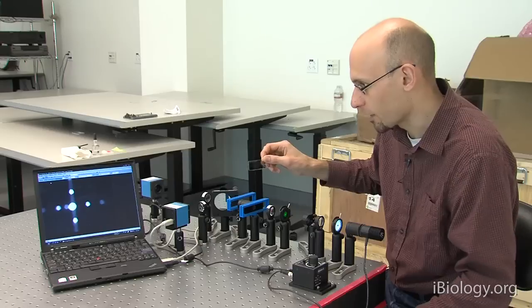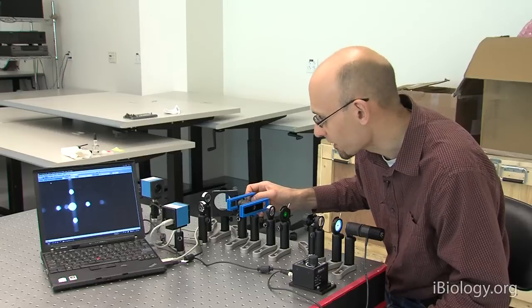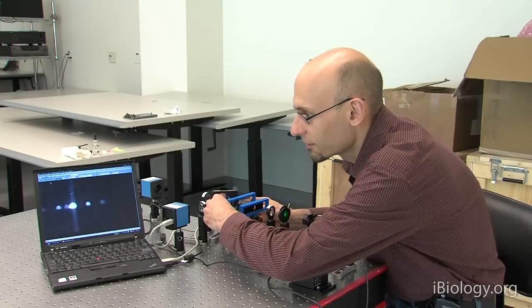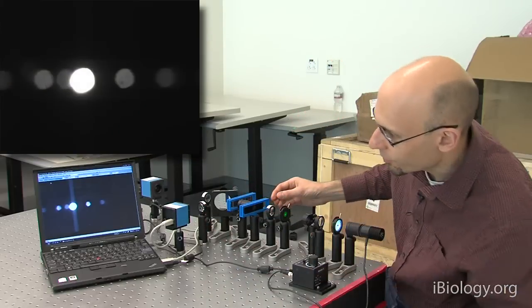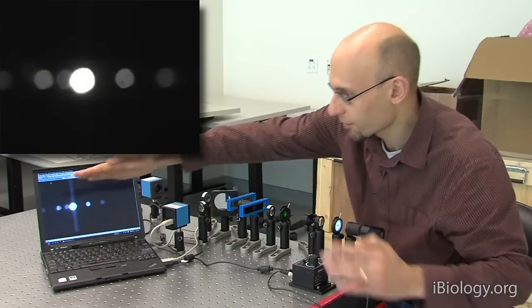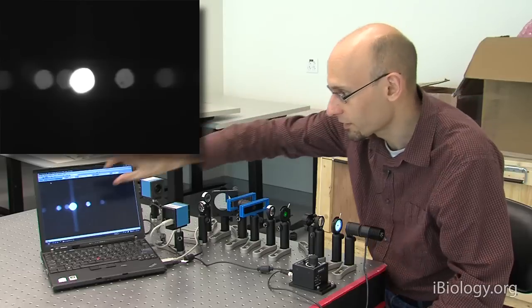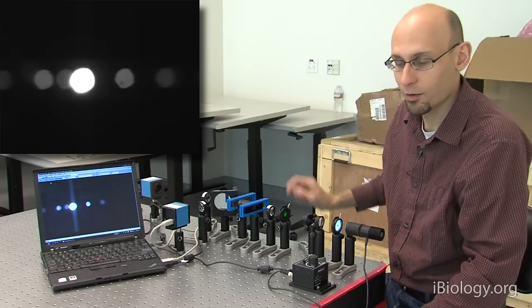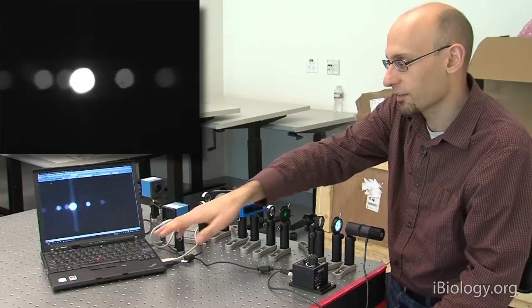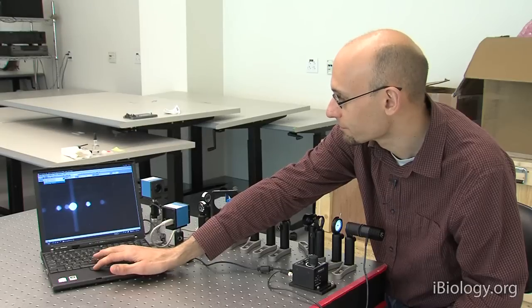So I'm going to start here by blocking all the vertical light. So I will slide this grating in and then position it height-wise. And so you can see now I've got this set of two black bars here so that they're cutting off all the light from above and below here. We're only letting through now the band of horizontal diffraction. And so now this diffraction pattern looks just like what we saw from our vertically oriented lines before.